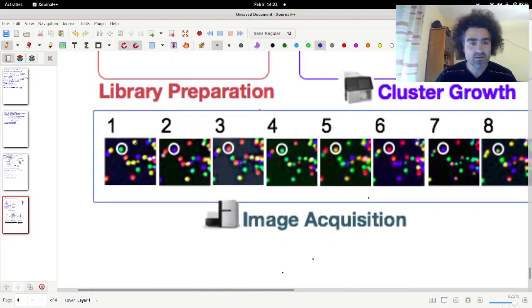This spot here, or this spot here, or these spots are different clusters of these clones of DNA. So exactly at moment 1, this cluster emits a green. So a green, if I remember well, was, let's say that green was G, which means that for this piece of DNA we have a G.